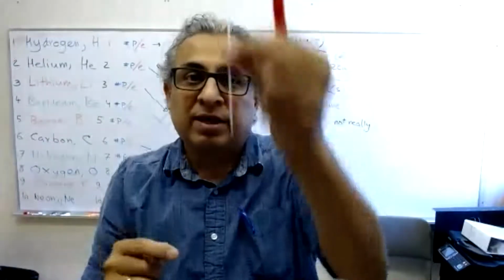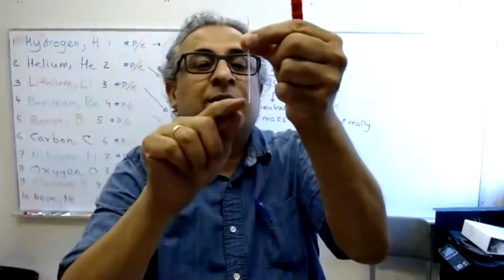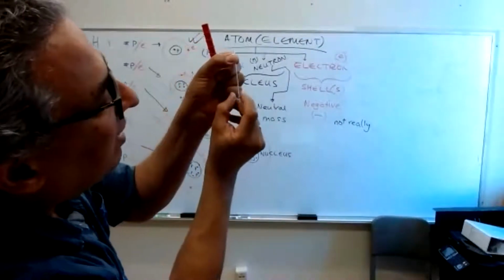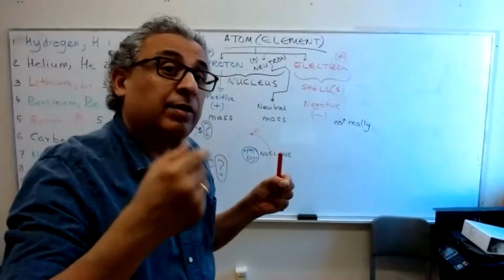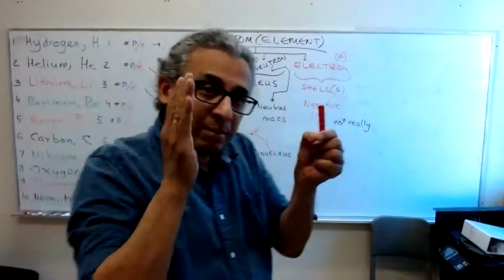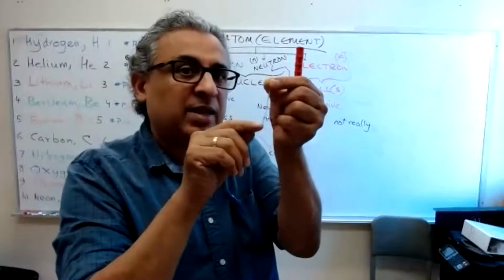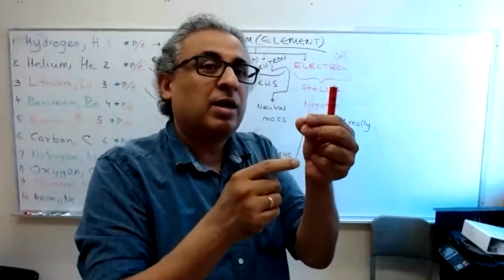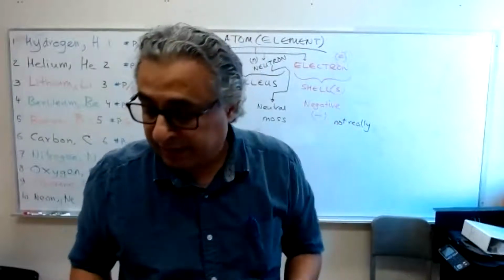Then you stick it inside your melting point apparatus, turn it on, and slowly start heating it up. Through a little magnifying lens, you can see the solid enlarged, really clearly, and you can also read the temperature using the thermometer. Once it starts to melt, the melting point starts there, like 120 degrees. When everything is melted, let's say it's 123 degrees, then you have measured the melting point of this particular solid from 120 to 123 degrees. It's always reported as a range.